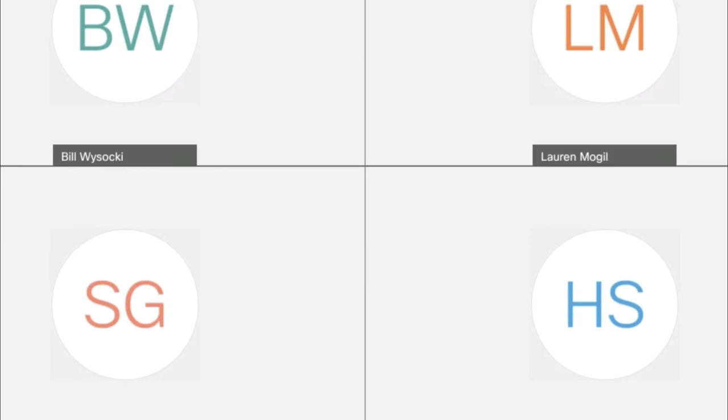I see one more question: where can we access the new GenCode file? This new GenCode file will be made available on the website gdc.cancer.gov. You can get there by going to the About the Data tab on the main page, and then clicking on GDC reference files. The GenCode 36 files and the old GenCode 22 files can be found there.